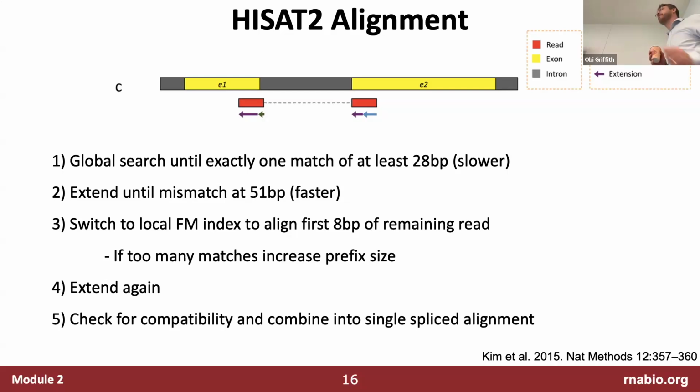What will the counting step do, is it going to be assigned based on some logic for this case, or could it be assigning the count to the two genes? Yeah, so the question is, downstream steps, when we start trying to count reads that support different genes or different isoforms, what will it do with that information? We're going to see. It depends on the tool. It depends how you run it.